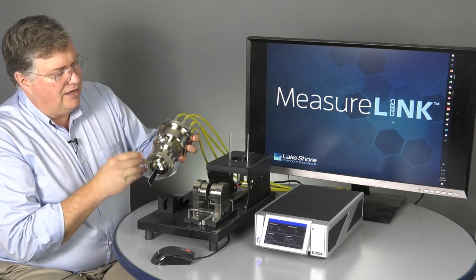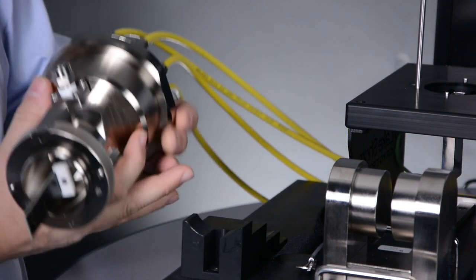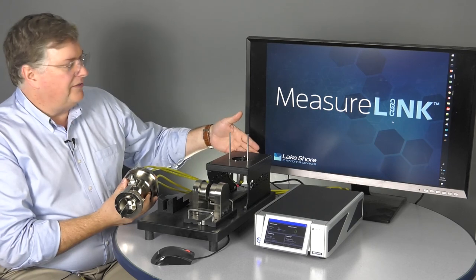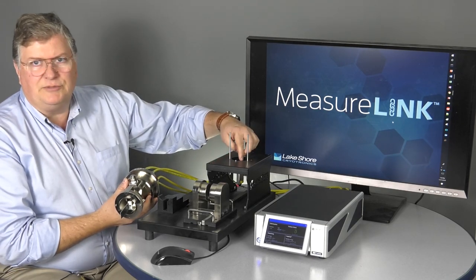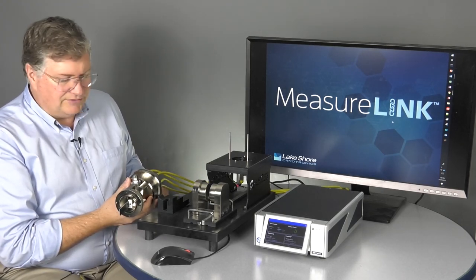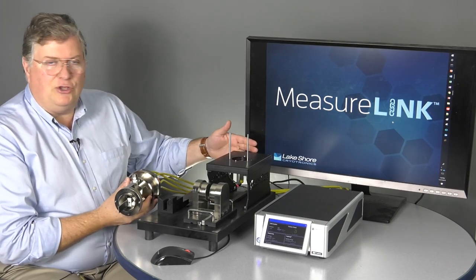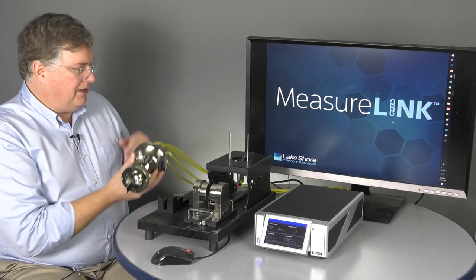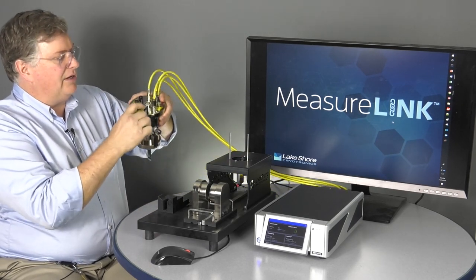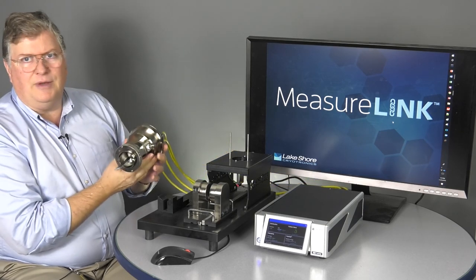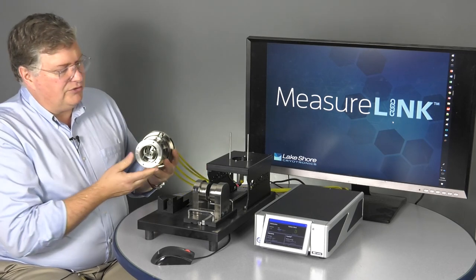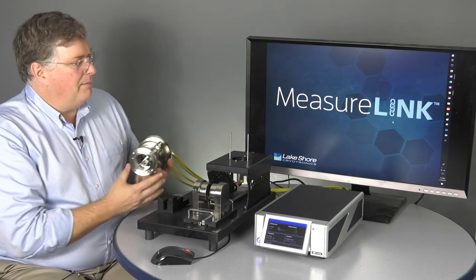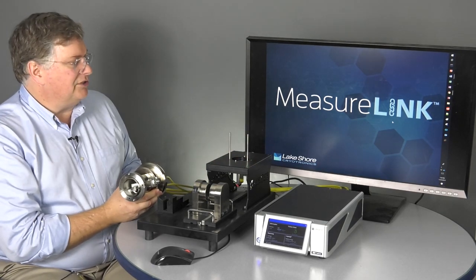We also have a purge valve here. This is a low-pressure relief valve and a purge connection in the back of the holder here. That allows us to have a nitrogen purge and flood the measurement compartment to free it of O2 for some samples that are sensitive to oxygen. We also have a vacuum. We can connect a small vacuum pump here, and with a modified top here, we can go with some hermetically sealed Tri-Ax connections and provide a vacuum option so that we can actually have the sample in vacuum as well. So, all of those things go together to really make this sample holder very appropriate for high-precision measurements.